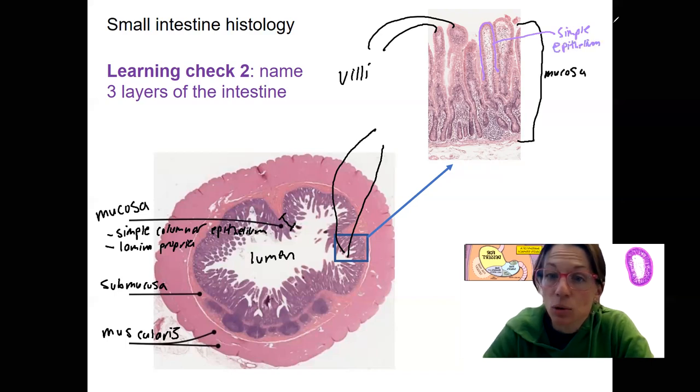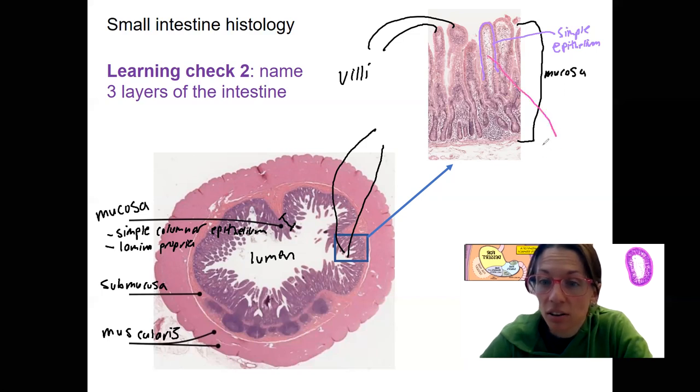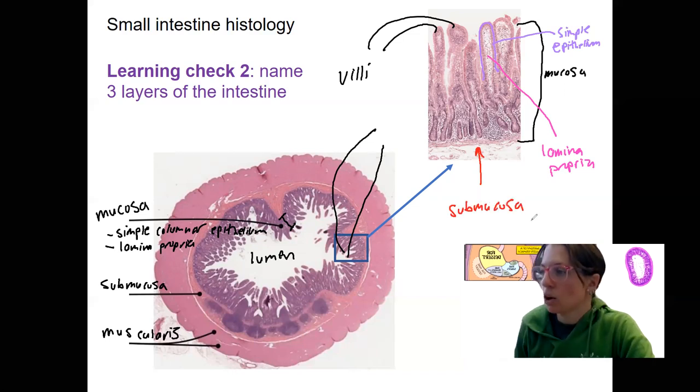And so what is that white and kind of light pink stuff in here? This is our lamina propria. The lamina propria is all along in here. The other layer you can see in the assumed inversion is what? Our submucosa. Wonderful.